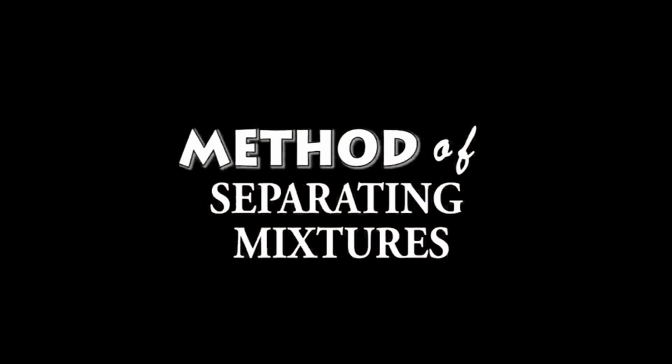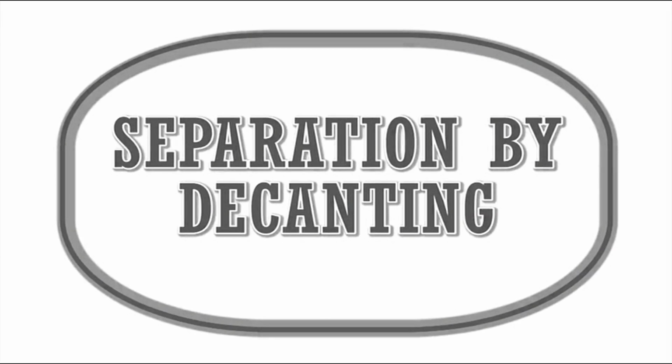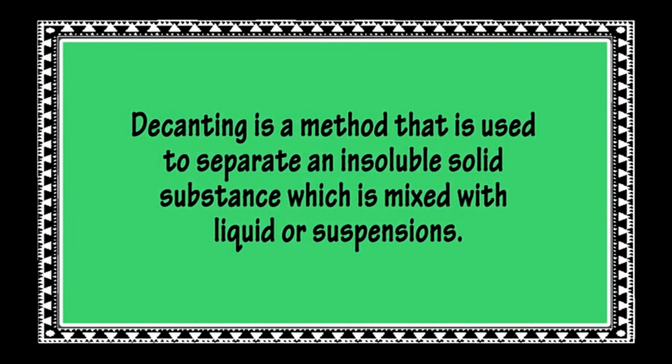The lesson on methods of separating mixtures. The topic for this experiment is separation by decanting. Decanting is a method that is used to separate an insoluble solid substance which is mixed with liquid or suspensions.